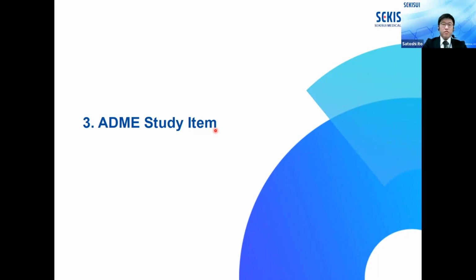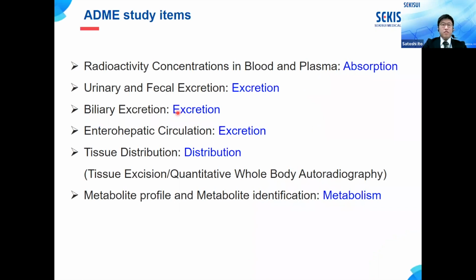Next, I will talk about some of the ADME studies we performed at our facility. These are some of the services we offer at our facilities: absorption, distribution, metabolism, and excretion of a candidate compound would be studied. I will explain this in a bit more detail starting next page.